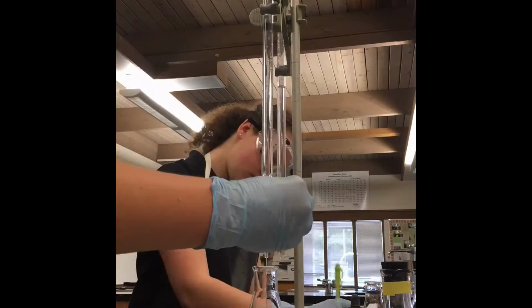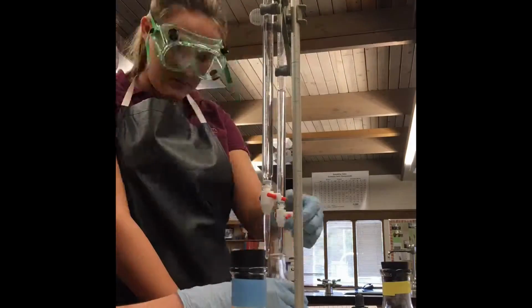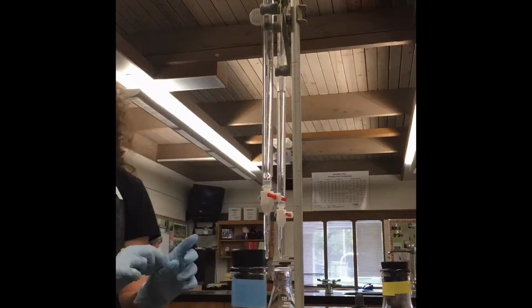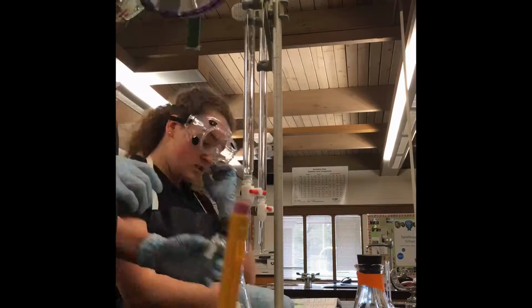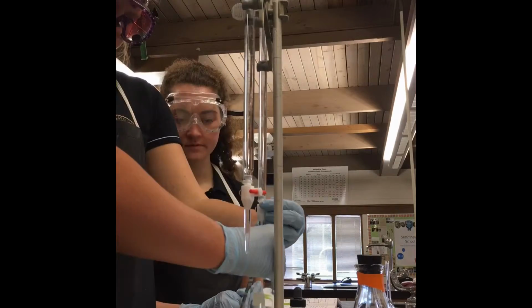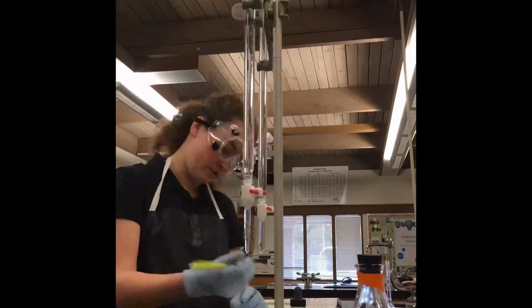Next, to a flask, 7 milliliters of acid was added as well as 3 drops of indicator. After adding the indicator, the base was released into the flask, constantly being swirled until it turned into a light pink color. Once the solution was light pink, the final volume of the base was recorded. This was used to determine how much base was needed to turn the solution light pink. These steps were repeated 3 times for each acid for all 3 acids.